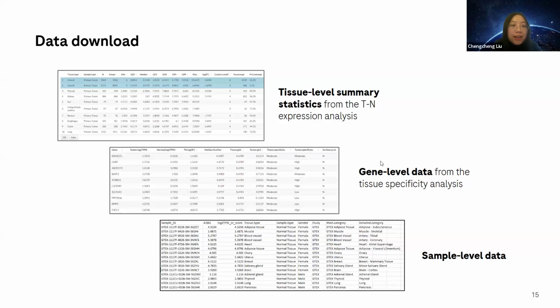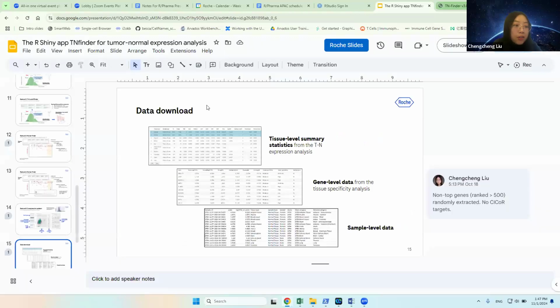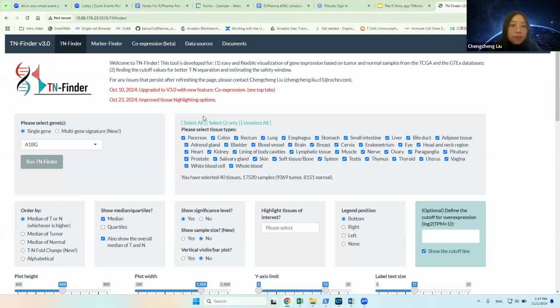And finally, it allows users to download the tissue level statistics, the gene level data, and the sample level data files. So there are 2 minutes left, so I'm gonna show a short demo.